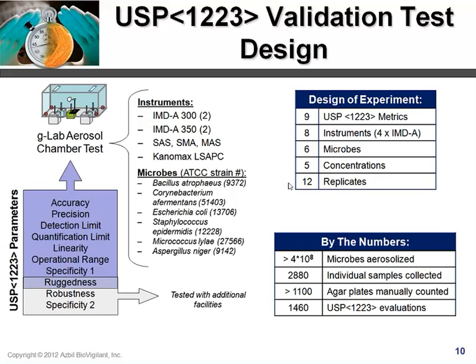So speaking of the data set, we developed a monolithic approach whereby most of the USP evaluations were performed on a common data set as opposed to performing different tests for each of those 9 USP metrics. The reason that we tried to approach it with a monolithic strategy is that it's more integrated and precise if you're doing all of your evaluations on a common set of data as opposed to different sets of data. However, to produce this common set of data, it required simultaneous and parallel sampling of all of the instruments I just listed, so all 8 instruments, which is not necessarily a straightforward thing to do. But if you're able to accomplish it, it helps preclude bias from inadvertent operator bias, inadvertent bias of the system, etc., and it minimizes systematic error like temporal variation and improves precision.